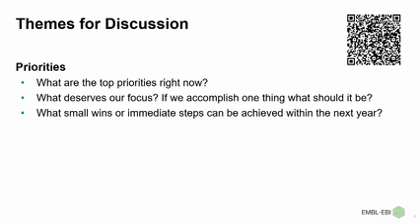Yeah, it's a really good question. Obviously, everybody's using different assays, different columns, etc. So there isn't, at least at the moment, a single retention time library out there that will work for everything. But as Nils just said, if we've got all this information, and I know there's people within the community within Europe working on this, being able to transfer across different assays, etc. as well. So including it now will be useful in the future.